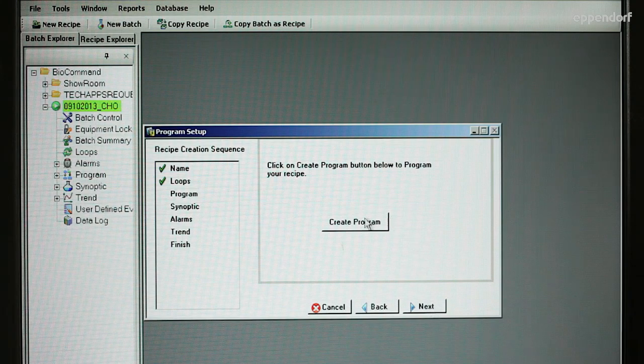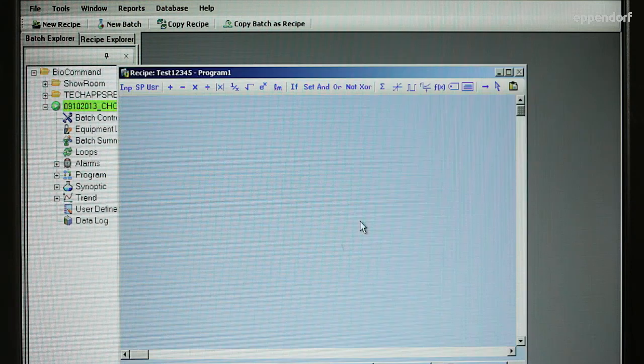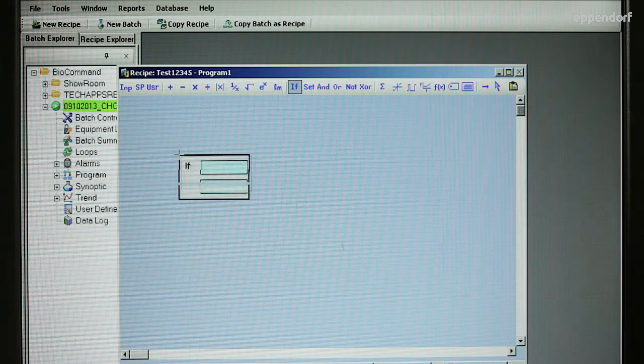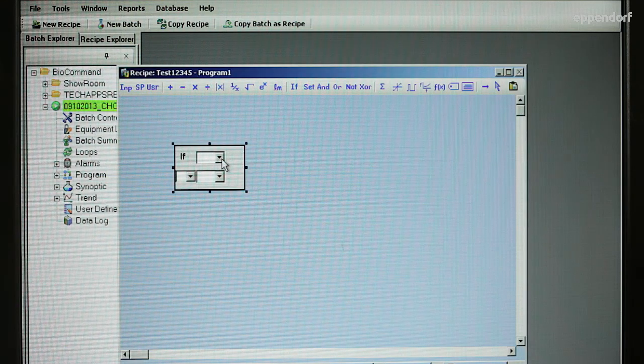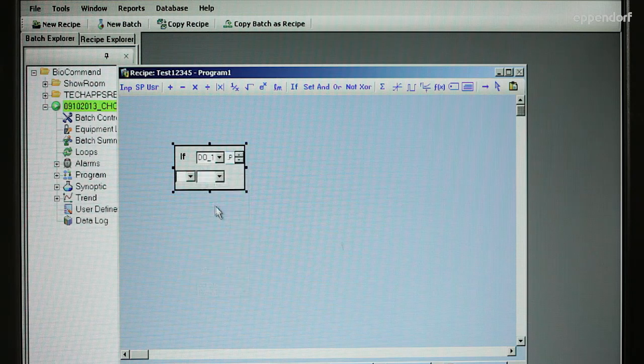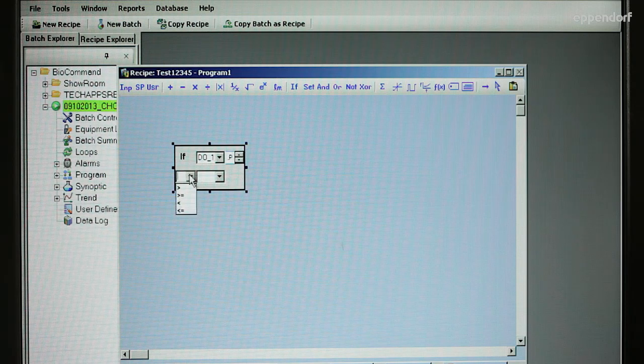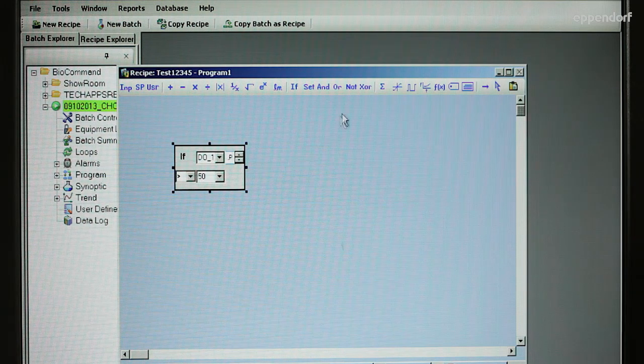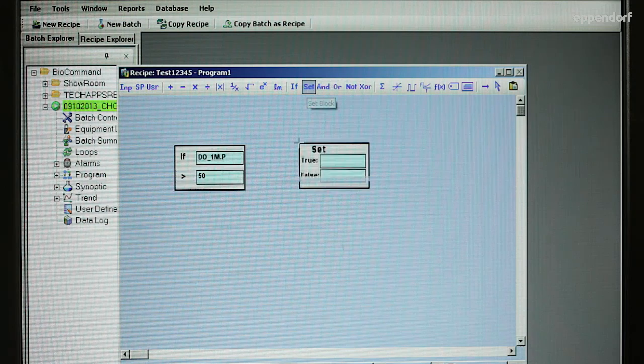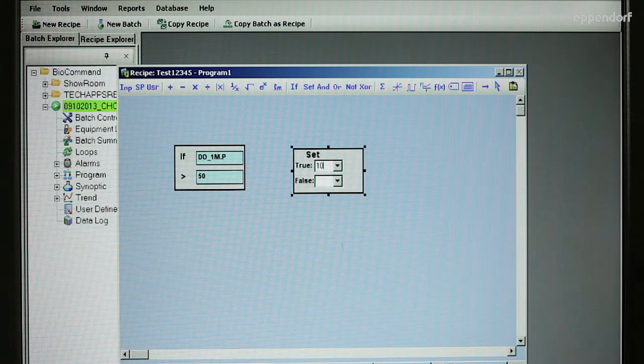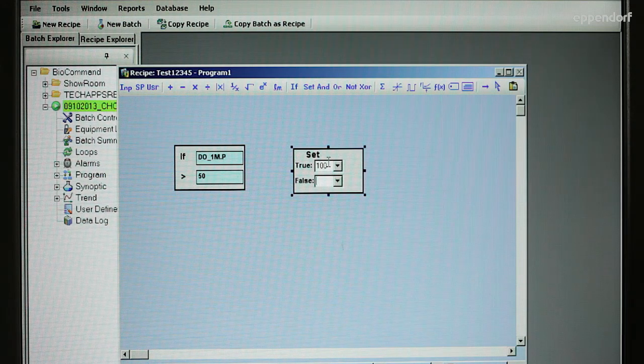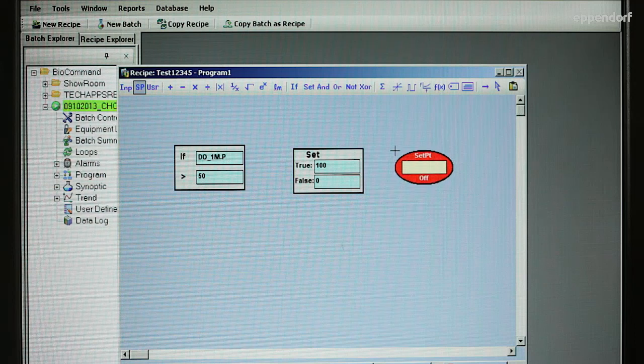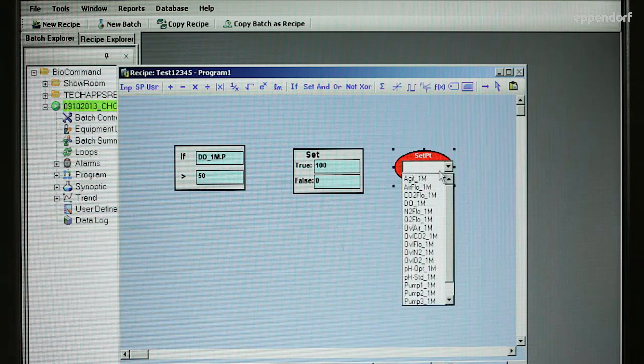Click on Create Program to create a program for your process. BioCommand has powerful programming tools that can alter setpoints automatically at specified times or when specified culture conditions are met. Users can create programs using functional blocks which include logical, mathematical, and user-defined functions or advanced visual basic programming.